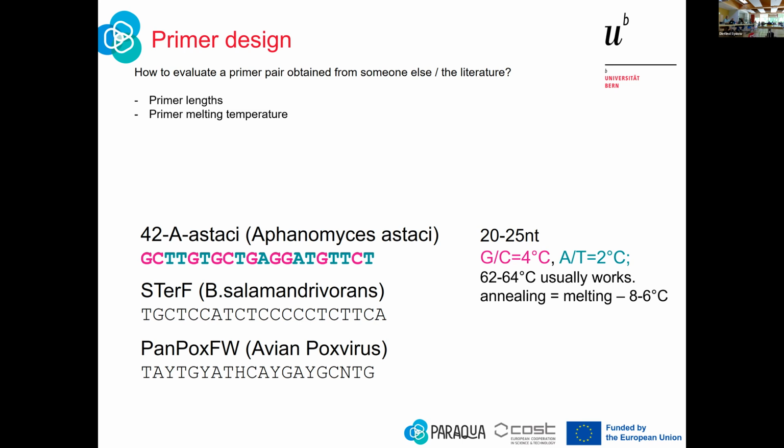There's many primer design programs, and while they do a good job in finding places that are kind of specific, it's very important to do these hand checks, because these programs spit out primers that I would never design by hand.